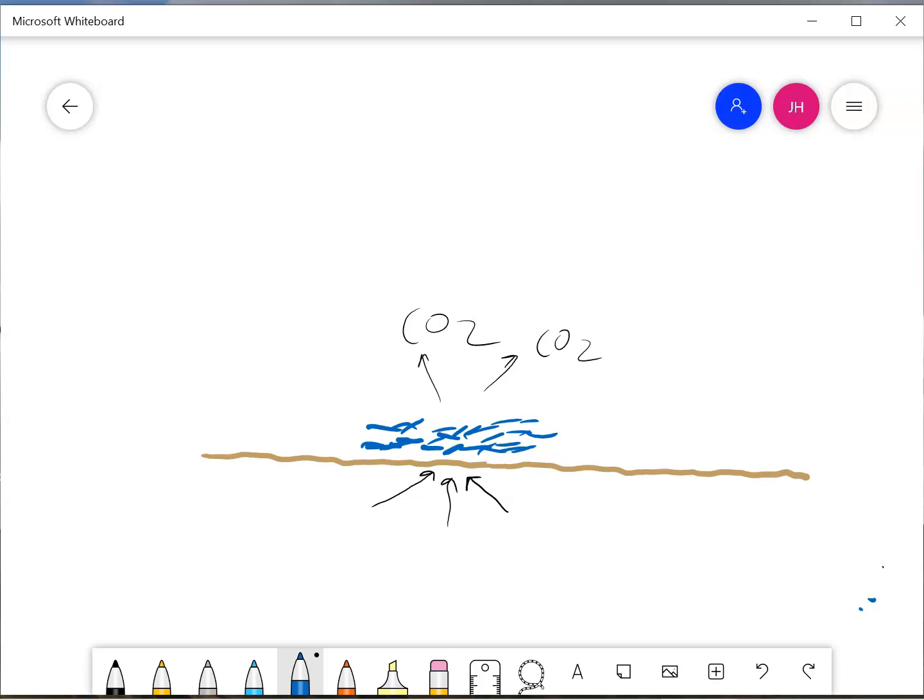So a bacterial colony is going to grow, and it's going to keep requiring these nutrients to move towards it through diffusion, and it's really going to grow until the nutrients can't get to it fast enough, or the waste products accumulate here and poison the cells. So it's going to grow until something goes wrong chemically to stop them from growing any further. So there really is a limit usually to how big a colony is going to get. So this is a microscopic view of a colony.